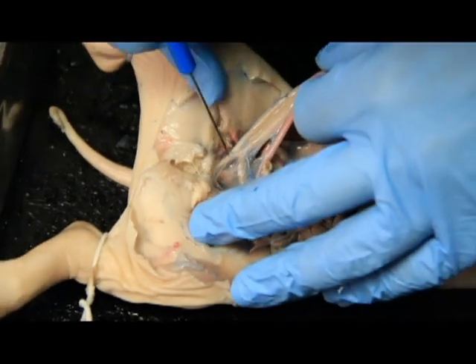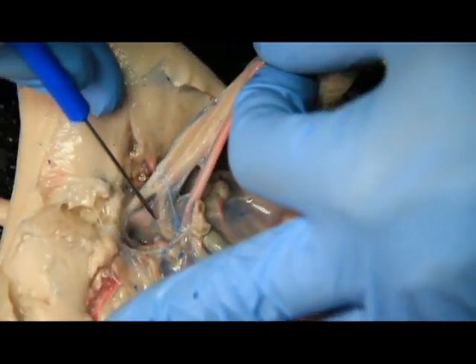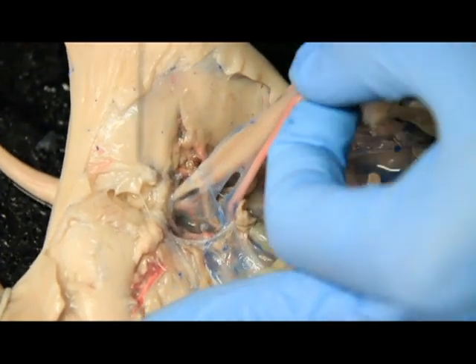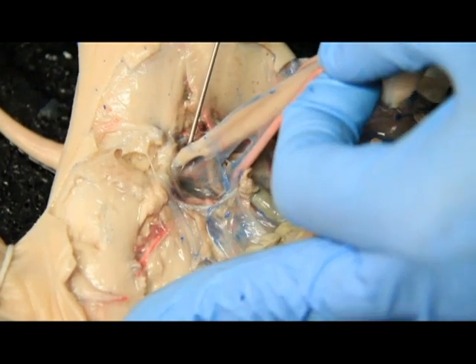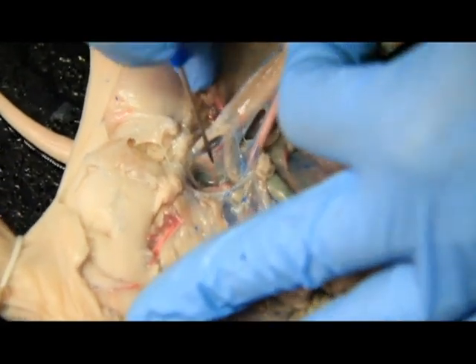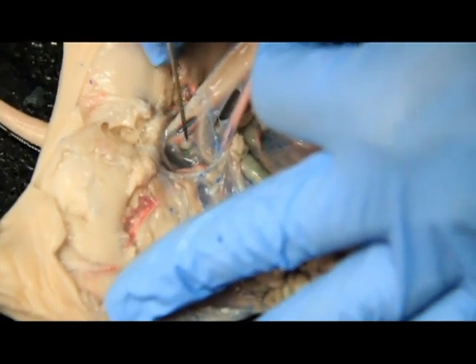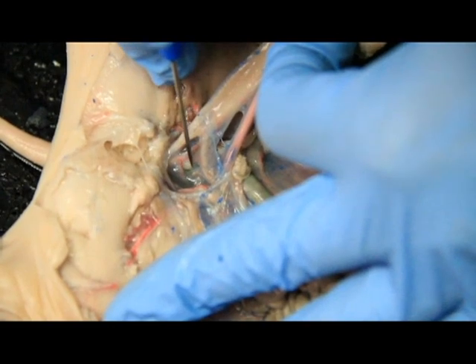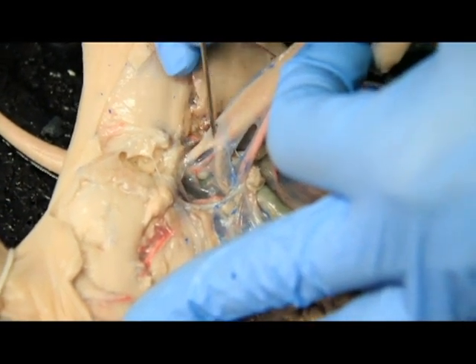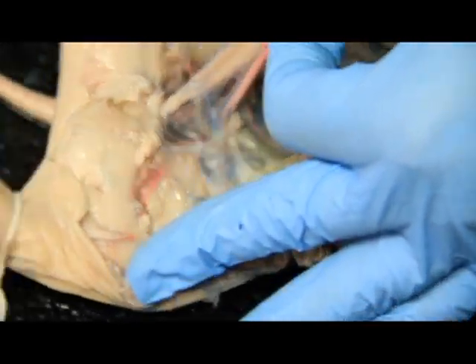And if you can see right here, you can kind of see how this attaches down here, but this tube kind of goes this way. Well, this is actually the urethra right here. So this white bit right here is where it connects down, and you can almost see the vagina below it, this other white tube that's down there below. So it's going down this way, and when this tube kind of comes up and goes whoop and does this flip upwards, this actually right here is where the urethra is.